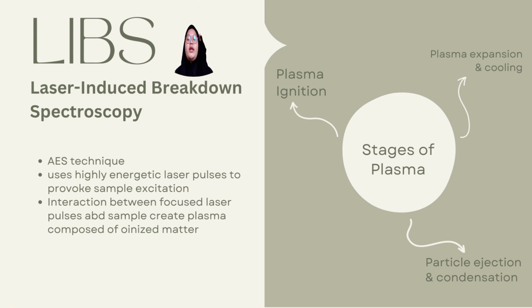LIBS can provide an easy, fast, and in situ chemical analysis with reasonable precision, detection limits, and cost. Additionally, as there is no need for sample preparation, it could be considered a technique that is suitable for a wide range of applications, including forensic analysis.